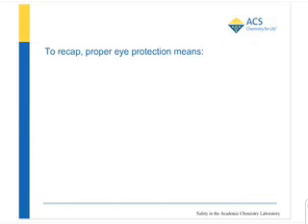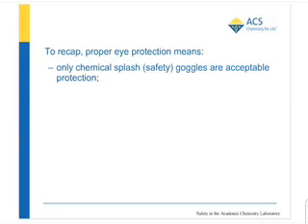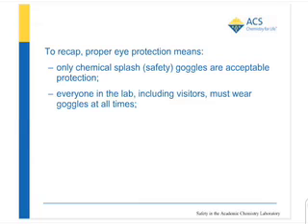Let's summarize the points made in this presentation about eye protection. Only chemical splash goggles provide adequate eye protection. Prescription glasses and visitor's glasses are not acceptable. Everyone in the lab, students, instructors, visitors, should wear safety goggles at all times that chemical operations are being conducted. This is true even if the individual is not carrying out an operation. If you are doing paperwork and don't want to wear your goggles, ask your instructor if you can work outside the lab or in an isolated section of the lab.